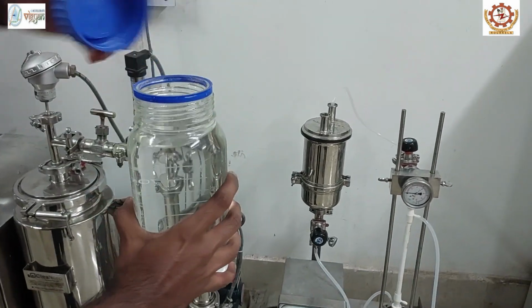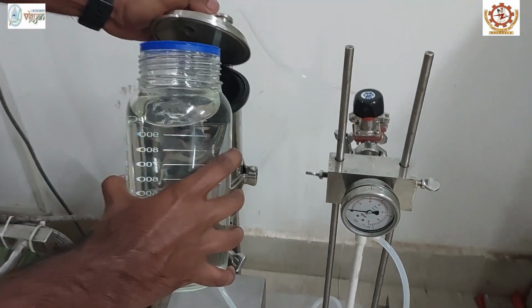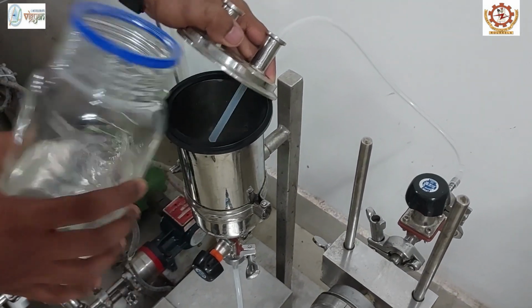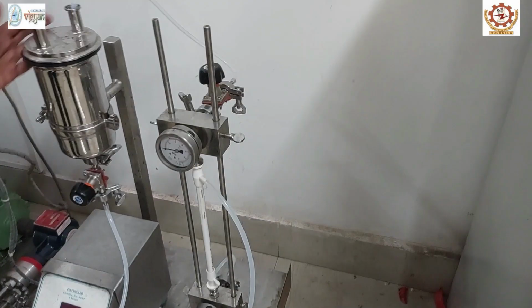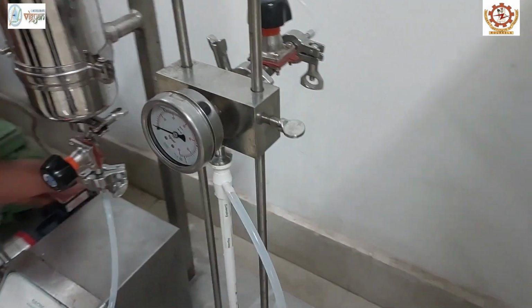We will take 500 ml of distilled water and feed it into the feed tank. This is approximately 500 ml of water. After that, we have to switch on our peristaltic pump.